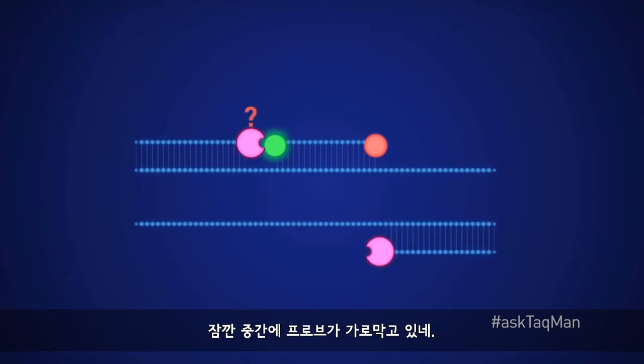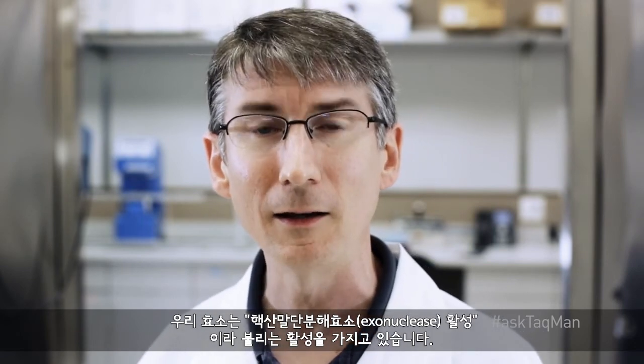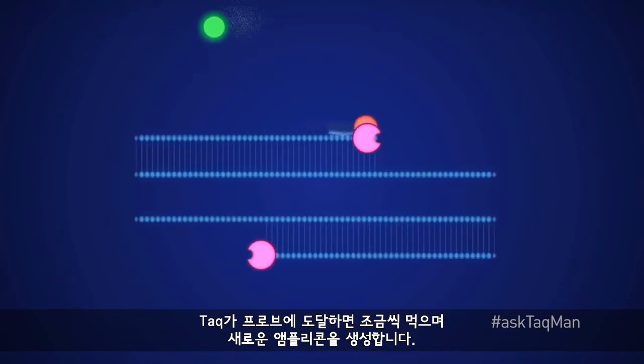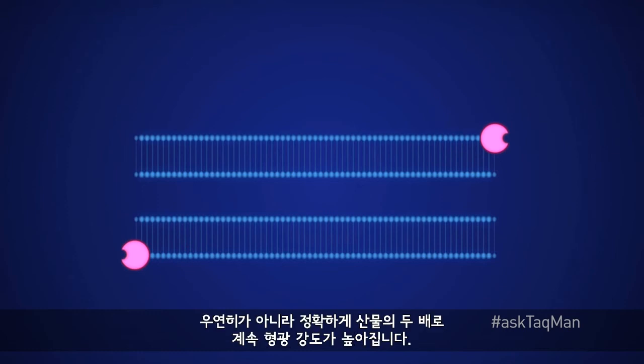But wait — there's a probe sitting in the way. It's a showdown in the making. Not Taq Polymerase. You see, our enzyme has what's referred to as exonuclease activity, meaning it pretty much eats DNA for lunch. So when Taq reaches the probe, it simply chews it to bits on its way to creating new amplicon. As a result, the reporter and quencher are physically separated, creating a permanent increase in fluorescence that perfectly accords with our doubling of product.